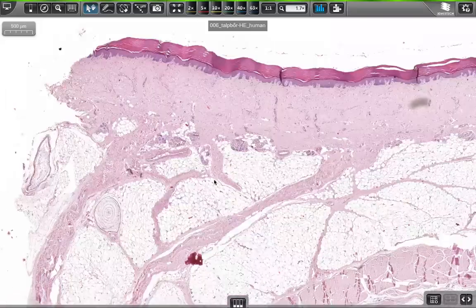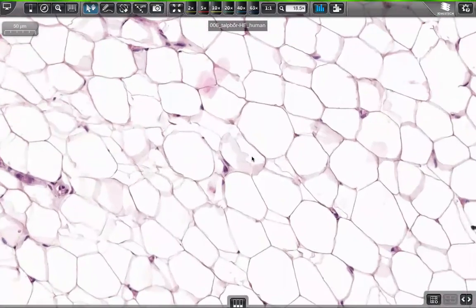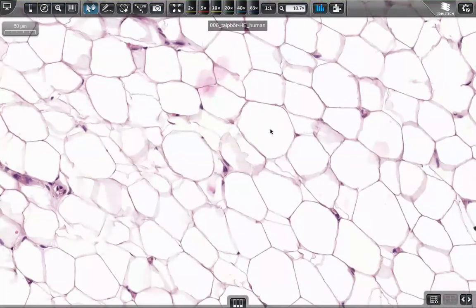Yeah, and underneath here we can see many adipocytes. The white adipocytes contain only one fat droplet, which is dissolved during the routine histotechnics. So now we cannot see the fat itself, just the dissolved fatty components and the space for it.